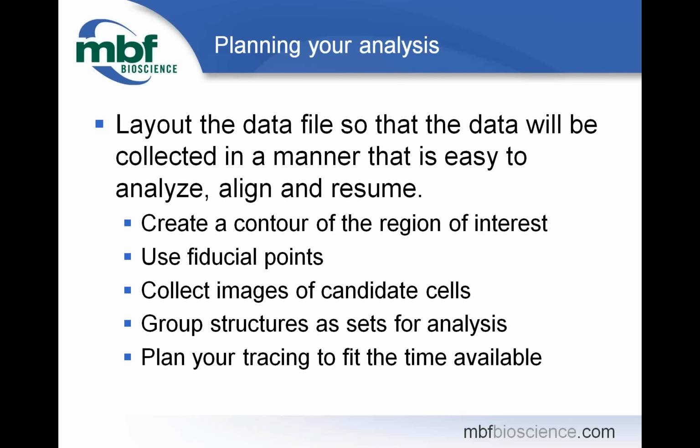As you're tracing, you can group structures as sets for analysis. This is especially important if you're going to reconstruct more than one cell per data file. And finally, you can plan your tracing to fit the time available. So if you only have an hour at the microscope, you can set up the goal for your tracing for that hour to make the most of that time. So that not only do you get the most out of that hour of tracing, but when it's time to resume, the data file is in a position to easily resume.